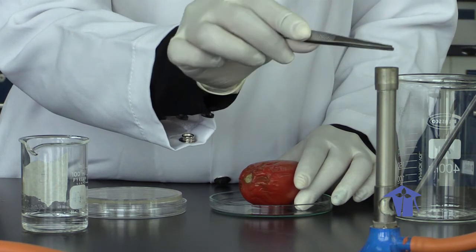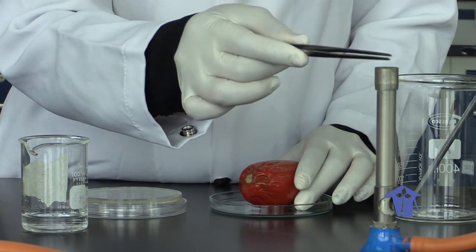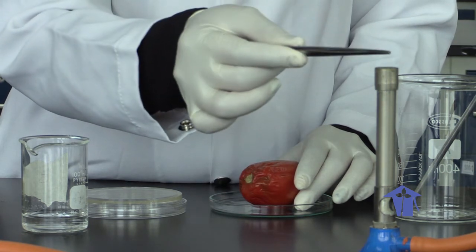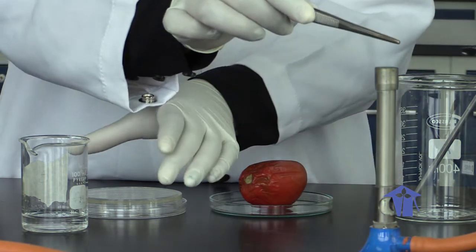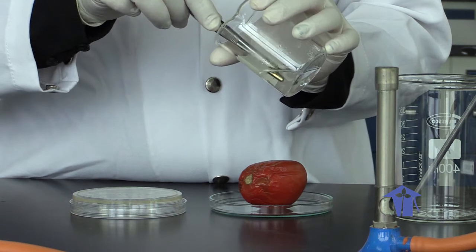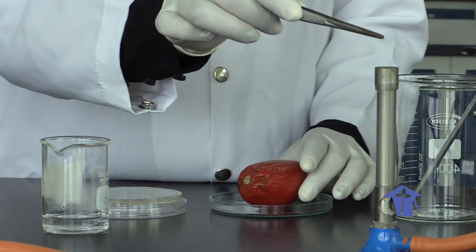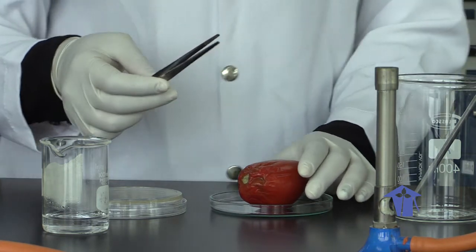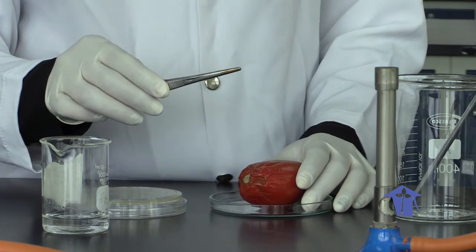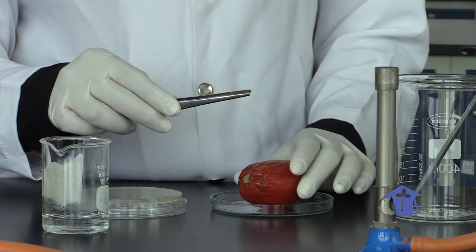So we flame until it's red hot. It's a little more difficult to see the red discoloration of our forceps compared to your inoculating loop. We immerse into alcohol and we flame off our alcohol. Remember, whenever we sanitize or sterilize equipment, we have to wait a couple seconds to ensure that the heat does not kill the organism that we are going to inoculate.